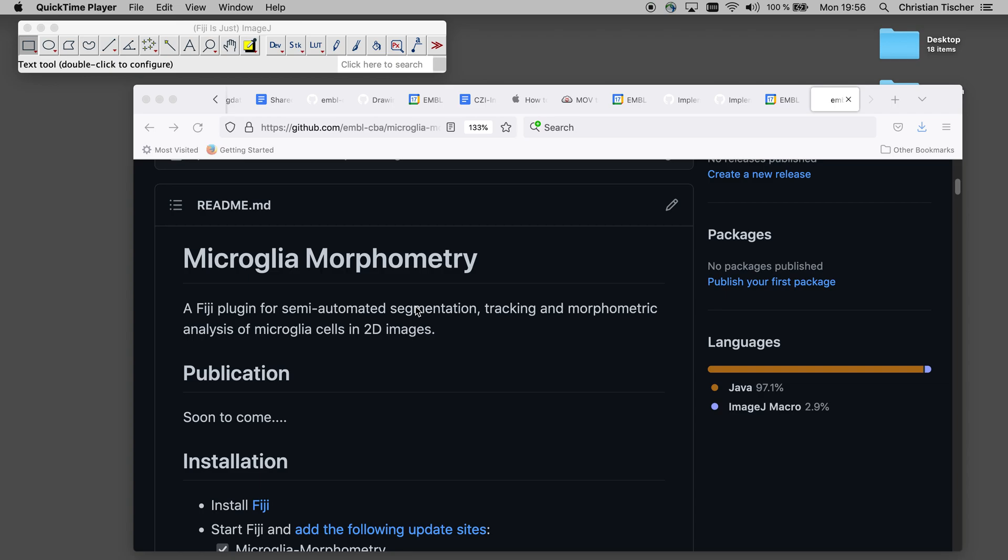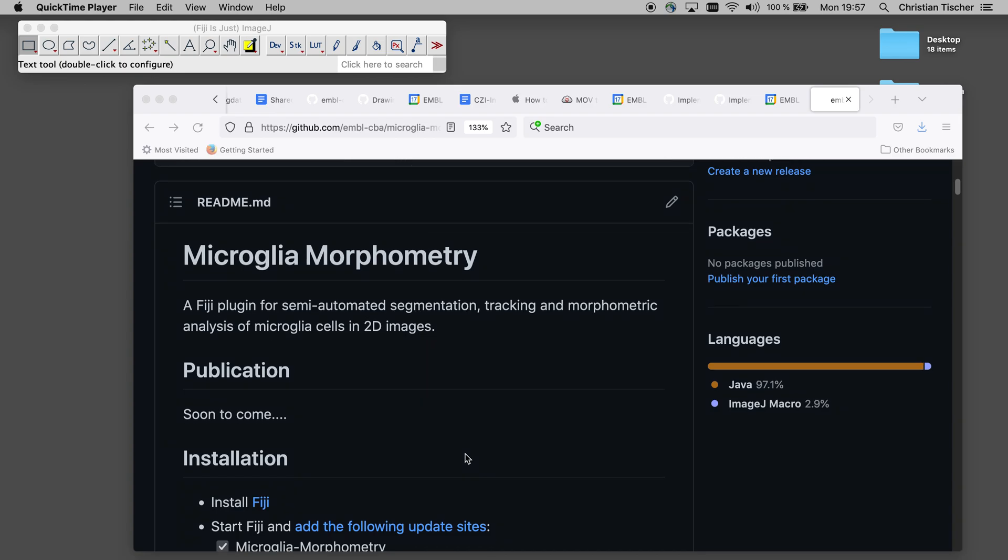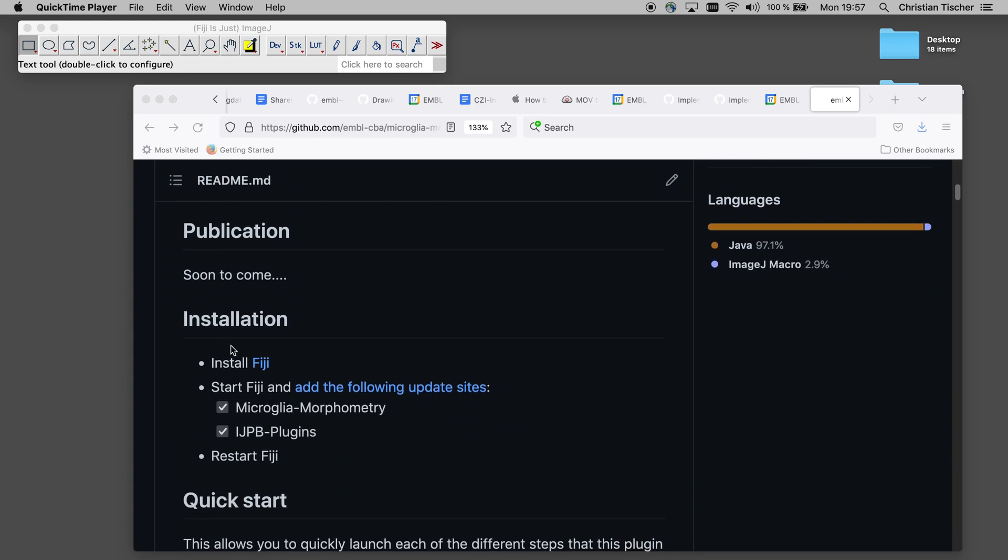Hi, I would like to show how to use the microglia morphometry update site for segmentation and tracking of microglia. So I have here a Fiji where I already installed the plugin following these instructions.